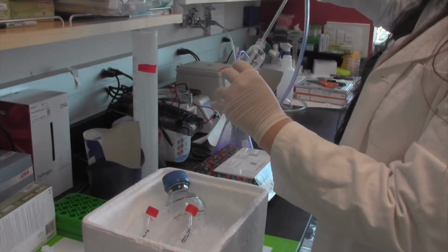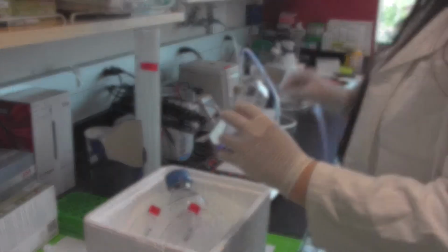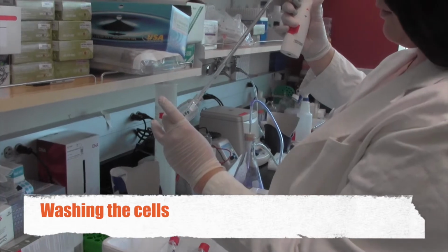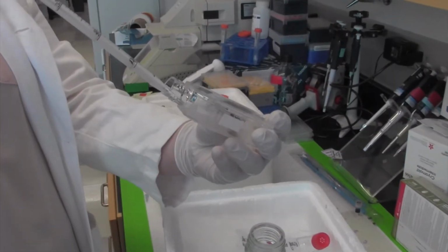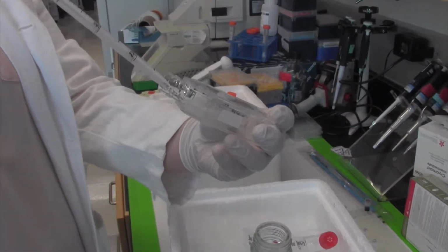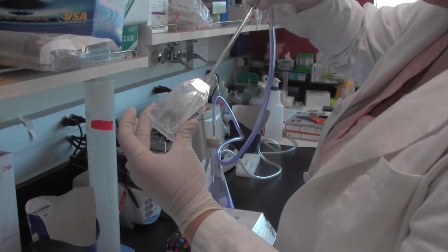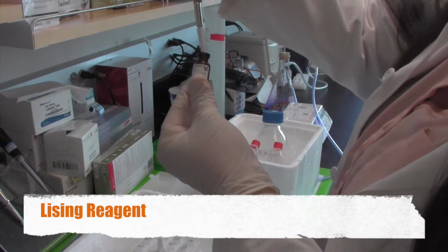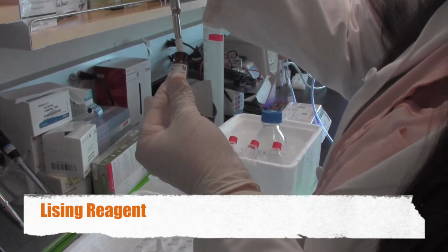The first step is to remove the media from the cells. We then wash the cells with ice-cold PBS. Next, we prepare the lysing reagent and the cells are processed for lysing.